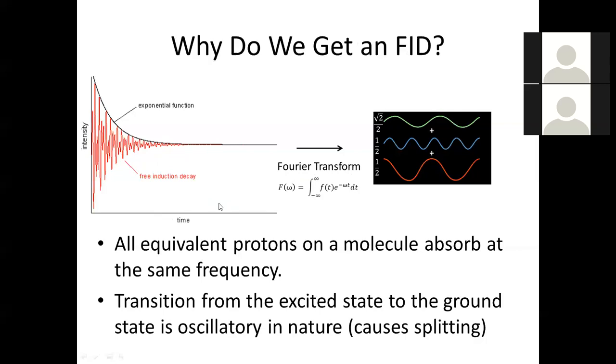is a little vector, right? On the time axis, it's showing the intensity versus time, right? We're going to project that vector onto a new axis, and in this case, that's frequency, and that's what the Fourier transform does. It's basically changing basis, right?